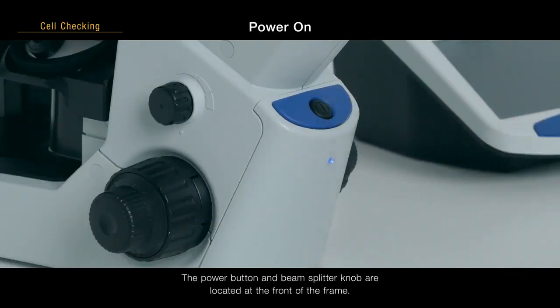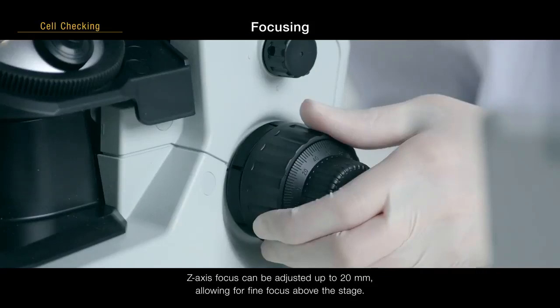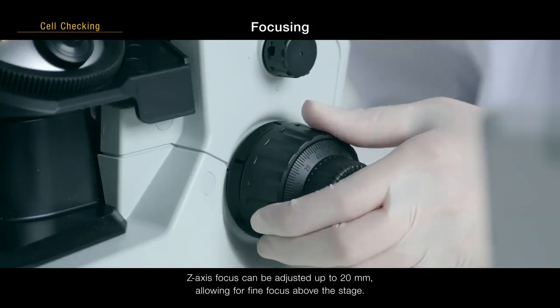The power button and beam splitter knob are located at the front of the frame. Z-axis focus can be adjusted up to 20 mm, allowing for fine focus above the stage.